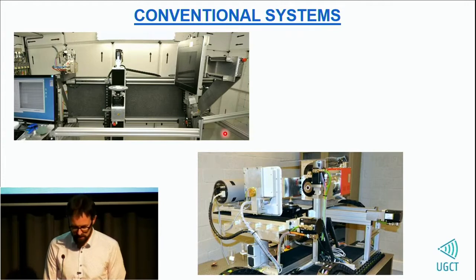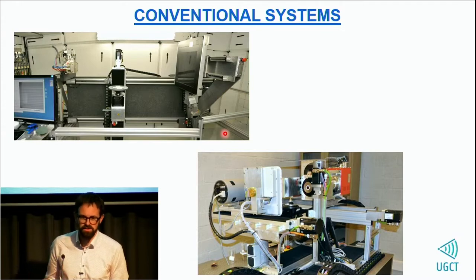That's then the Nanowood scanner. As the name suggests, it was mainly built for wood research, really to go to that very high resolution to characterize those wood species and to do the research on wood samples.